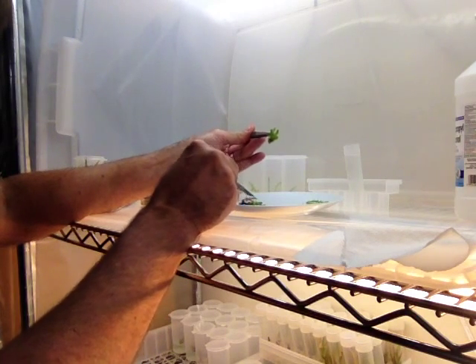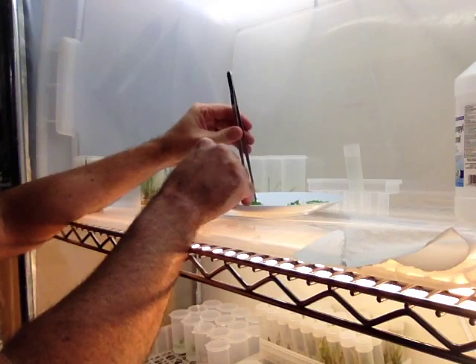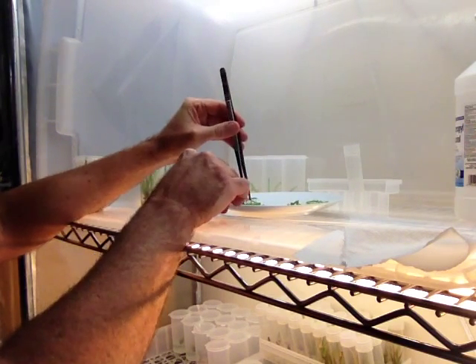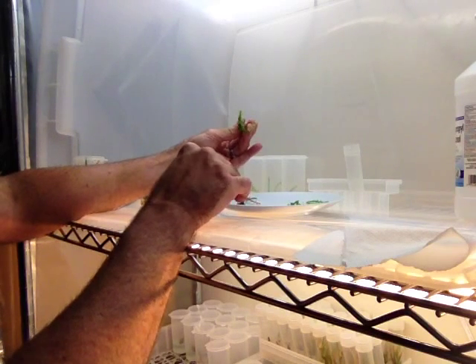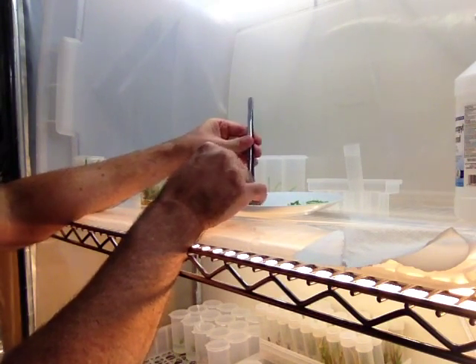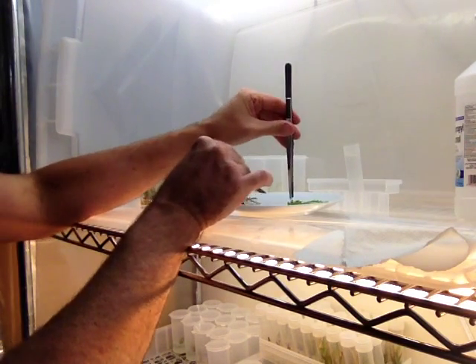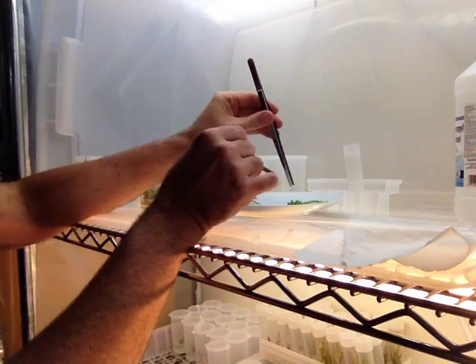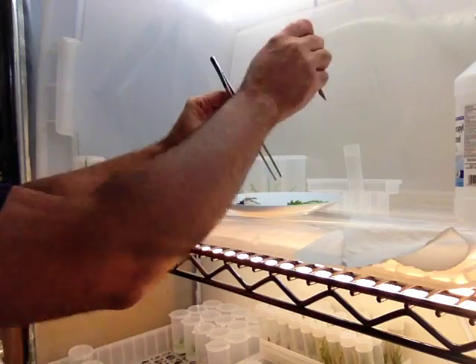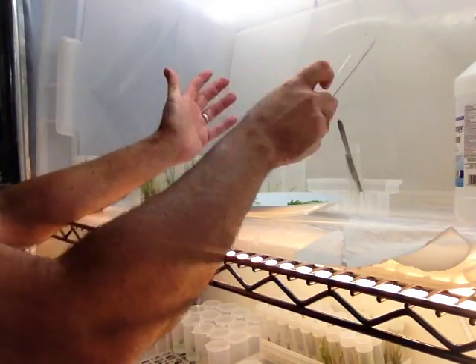That's mother tissue. You can see that. I could split those or plant them together — they're going left and right, so I'm going to go ahead and split them. One, two, three, four, five, six, seven, eight, nine, ten, eleven. Eleven plant pieces from one, or two if you count the whole jar.